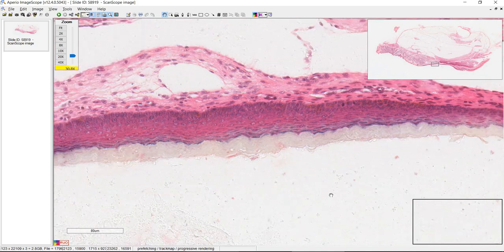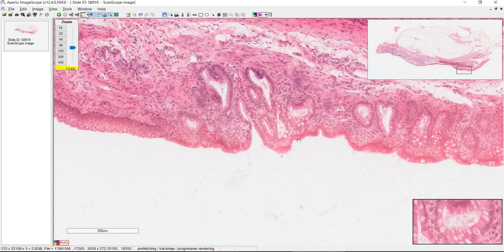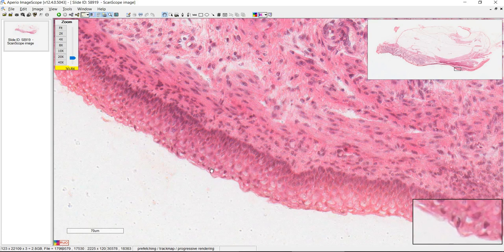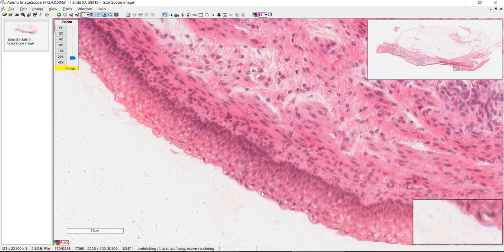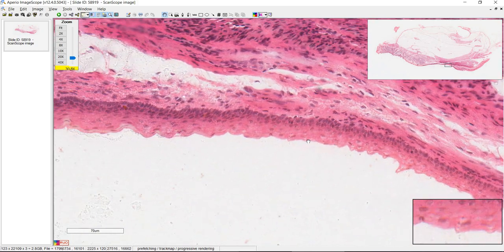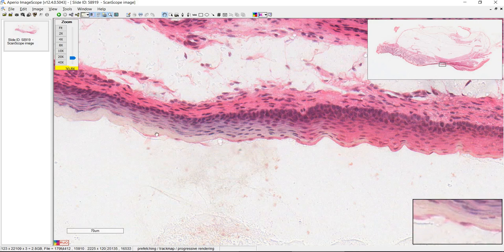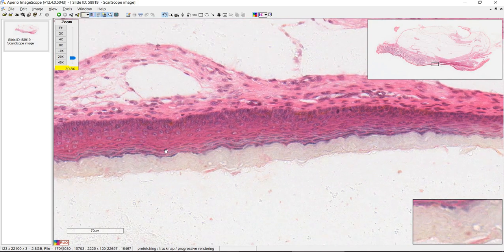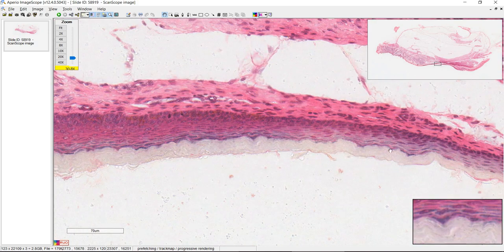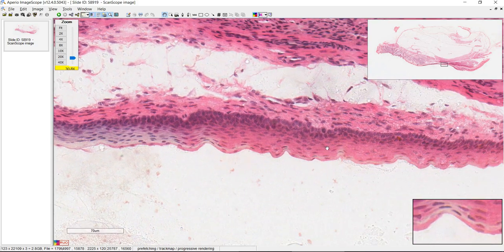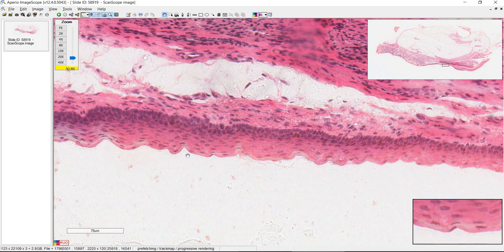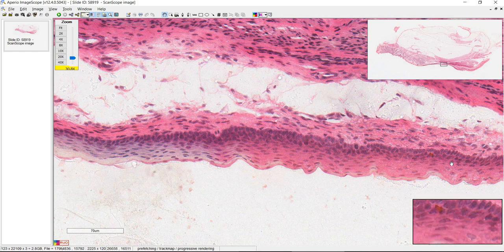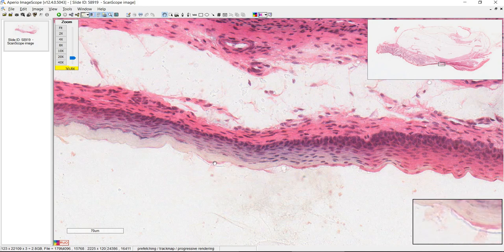If we look distal to the pectinate line — right around here — we have stratified squamous epithelium, but it's not keratinized just yet. You can see nuclei all the way out to the most superficial layer of cells. But if we keep going, you can start to see keratin forming — there are no nuclei out here. So this is keratin, which you would expect because now this is skin. This is keratinized stratified squamous epithelium. The transition — somewhere around here — that's Hilton's line, which is the separation between non-keratinized and keratinized stratified squamous epithelium.